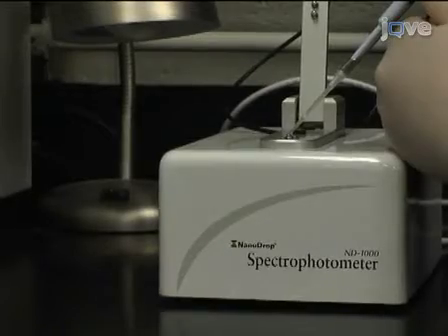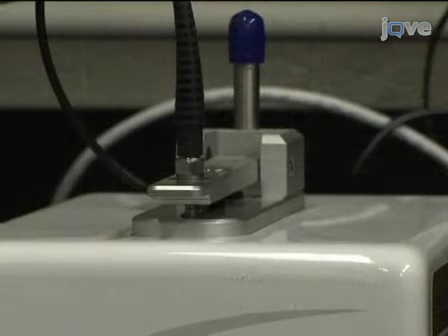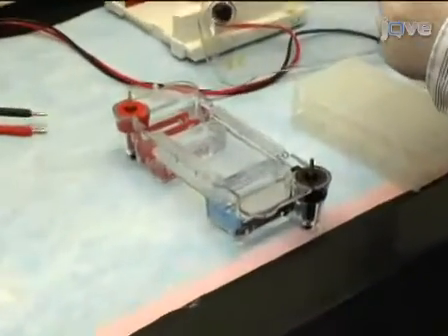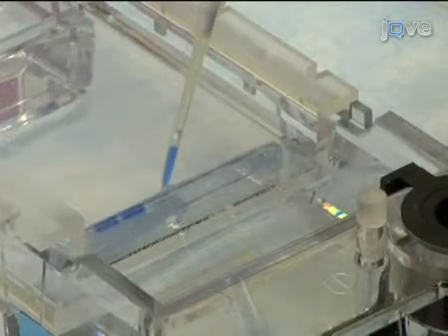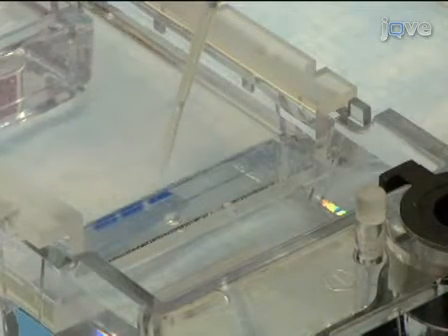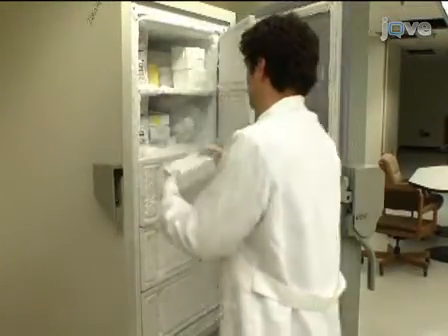Check the quantity and quality of the RNA using a NanoDrop ND-1000 spectrophotometer following the manufacturer's instructions. In addition, run a denaturing gel or use an Agilent 2100 Bioanalyzer to check the integrity of the RNA. If the RNA quality and quantity are satisfactory, move on to cDNA synthesis. Store the RNA at minus 80 degrees Celsius until cDNA synthesis can be performed.